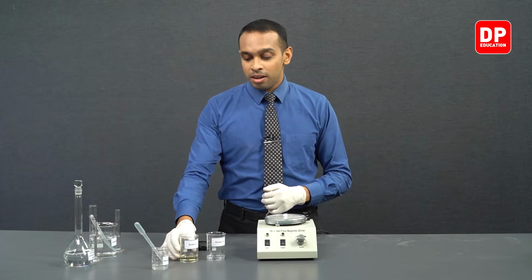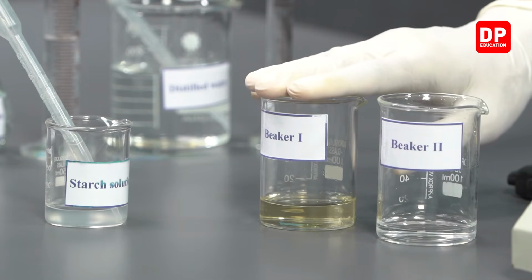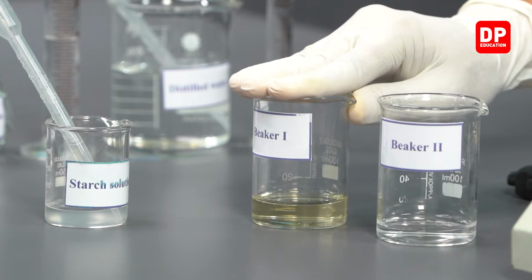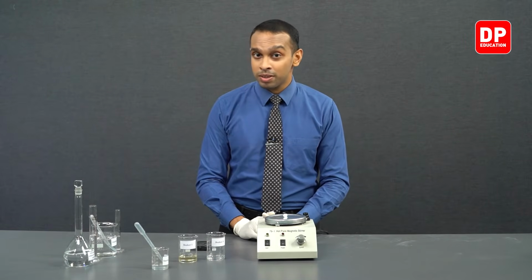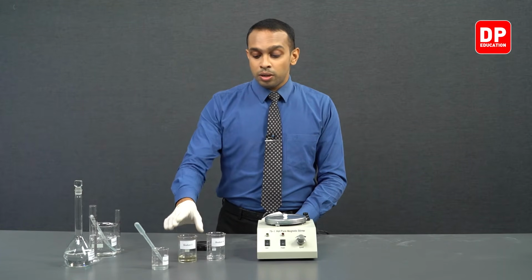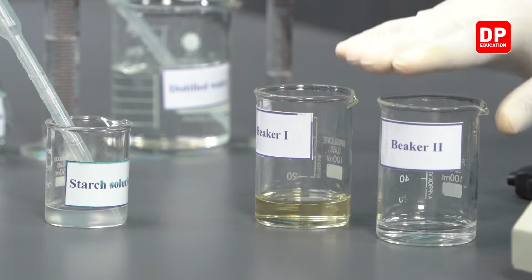So students, after going through that part, now we are going to observe what we will be doing here. So we have already measured 20 milliliters of acidified Fe3+ ion solution into beaker 1. The initial concentration of the solution that we prepared in the previous parts of this experiment was 0.1 moles per decimeter cubed. So we are going to add this Fe3+ ion solution, or actually 20 milliliters of this Fe3+ ion solution, into beaker 2.